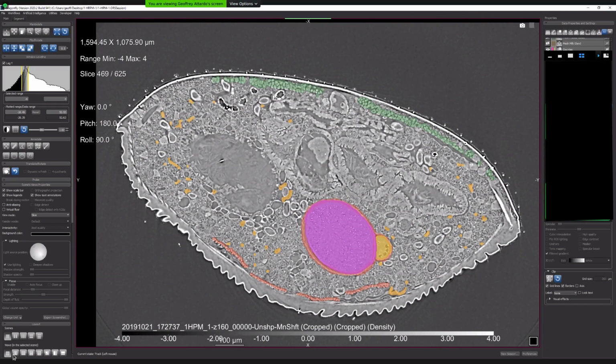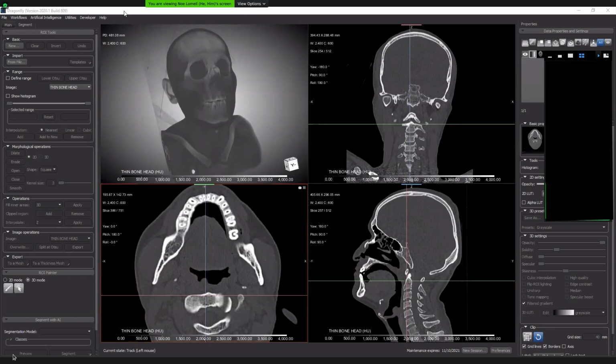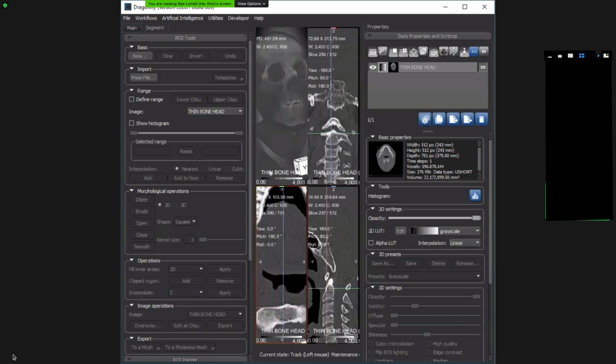Okay, I see. I think you are ready, and I'll show you, because you have already made the manual segmentation, which can be used as the ground truth for our next training step. So it's much easier for you to do. I will continue. I think you are ready. So we'll switch to the next view, so we can make sure everyone is ready too. Okay. You see it now? Yes. Okay.